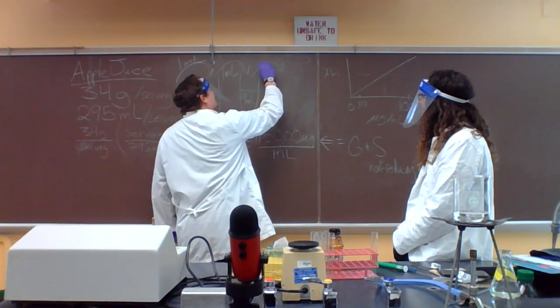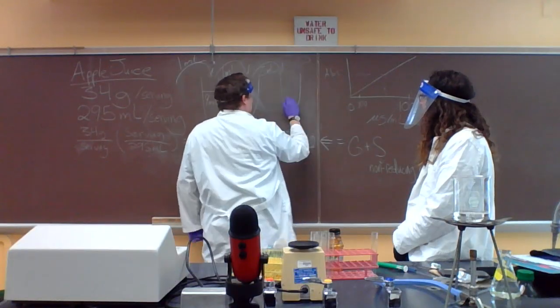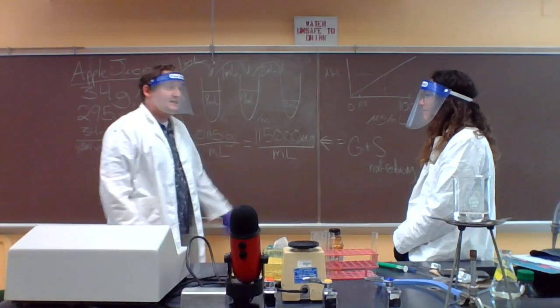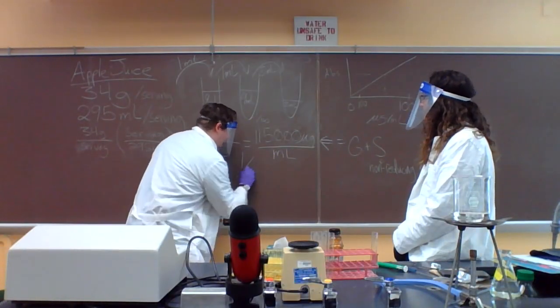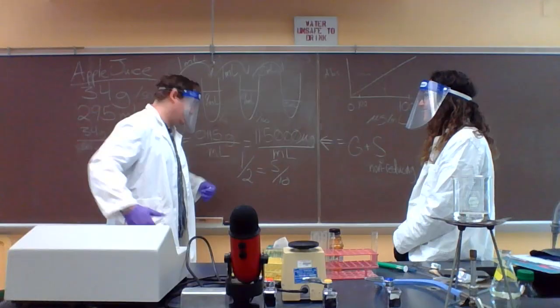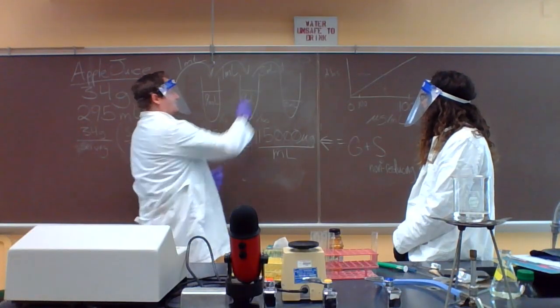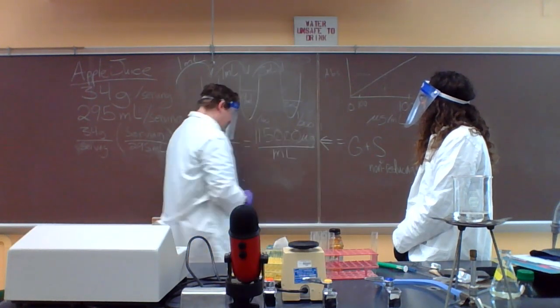So, 5 milliliters out of this into 5 milliliters of water. That's a 1 in 2. Just to be clear, 1 over 2 is equivalent to 5 over 10. Hopefully that's entirely intuitive. If not, talk to us. We'll try to get you right back on track. And there you go. That's a 1 in 2 dilution, giving us a total of 1 in 200.